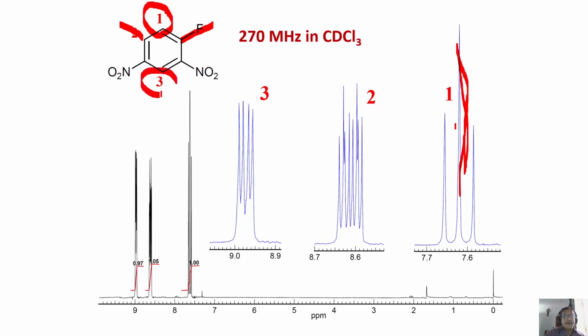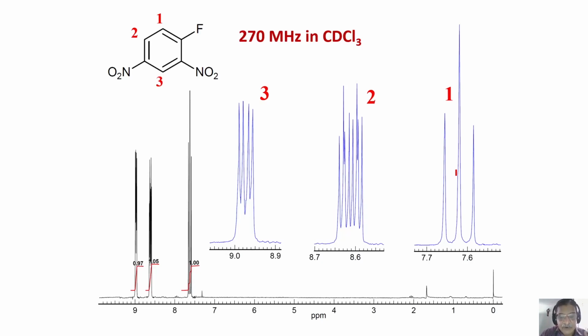Then what happened to this coupling? Long range coupling you don't see. I told you, in this case we didn't see this 1-3 coupling. Consequently, when you observe 3, you don't see 3-1 coupling. So that's what happens. So assignment type became very clear for you now with this. I hope you are all with me. I took several examples here, simple molecules to analyze based on the multiplicity pattern. I also took heteronuclear coupling so that you will know, the heteronuclear being present, coupling will always be there.